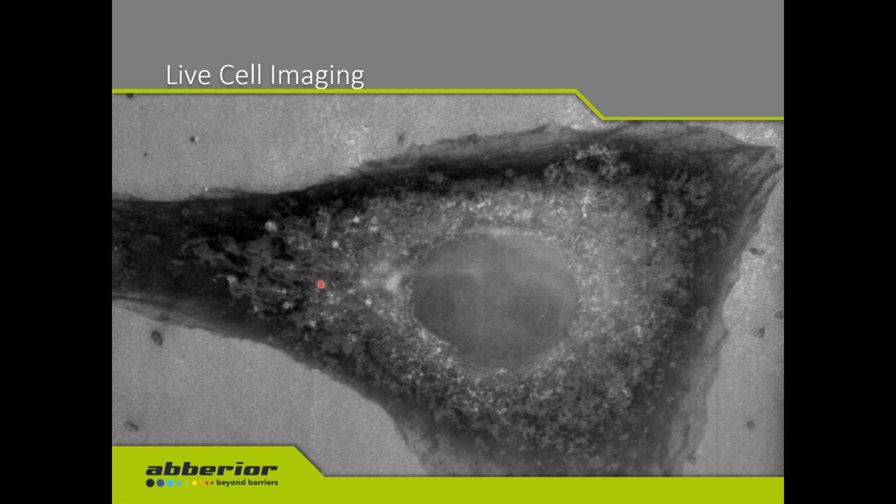To really distinguish our targets, we have to label those targets with fluorescent molecules, reading out the fluorescent signal by our fluorescent microscope.